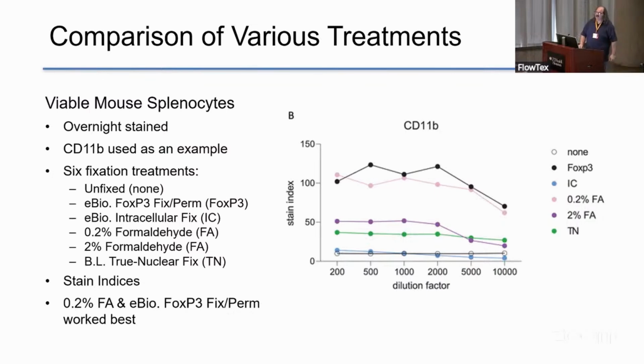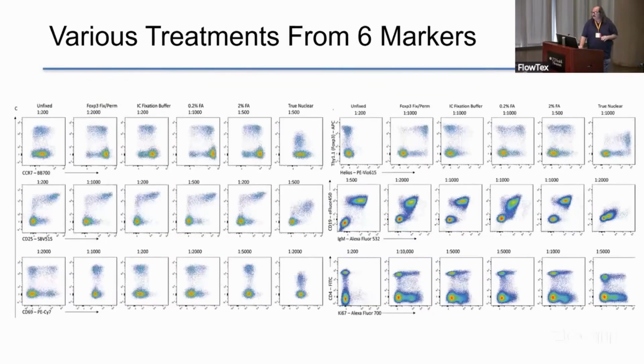And I've actually cut one where they started looking at the effect of if you change up the materials, the liquid you stain in. Instead of just doing one staining buffer, they did a whole bunch of them. So like I said, the amount of work. Oh, and by the way, that was just CD11B. This is actually 6 additional ones they have in the paper.